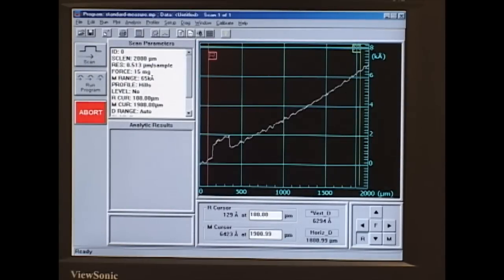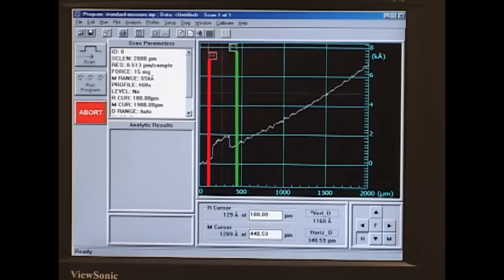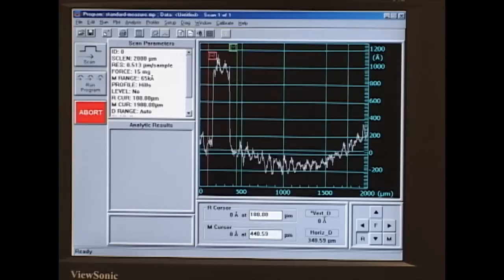A lot of times when we do these measurements, the instrument doesn't pick up on how level our sample is. So we'll want to level it. And we can use these two cursors, R and M. We'll put them on two points that we know should be level. And we'll click in this toolbar on level the trace at the current R and M cursor intercepts. So now we have something that's level.